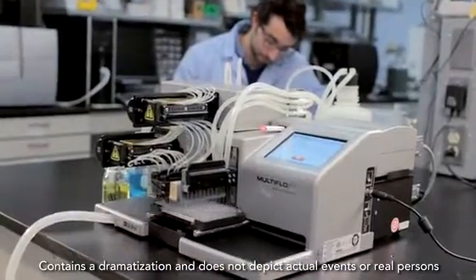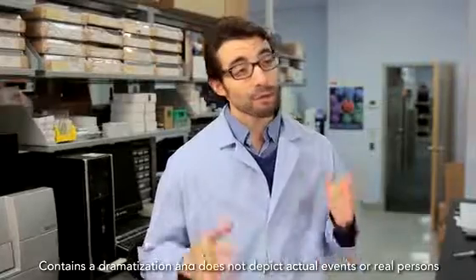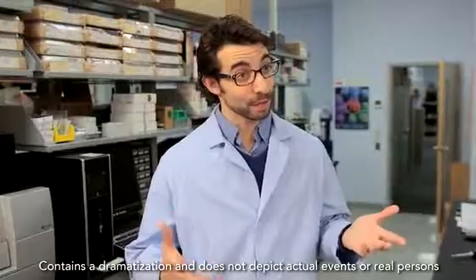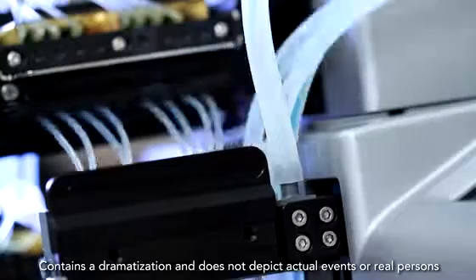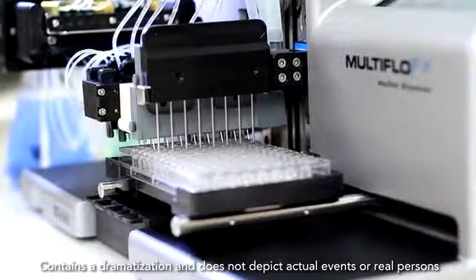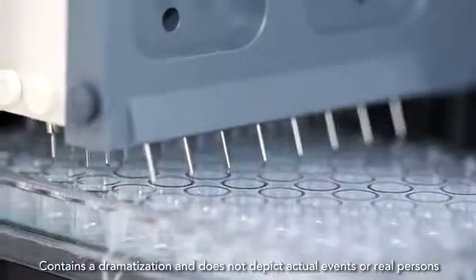Now we're running more assays and we're running them faster. We've got four reagents being dispensed in parallel, and what's great is each is independent, so there's no chance of carryover. And we're using a lot less reagent because of it.